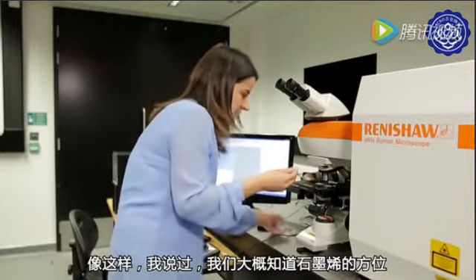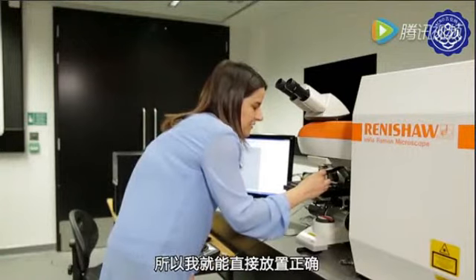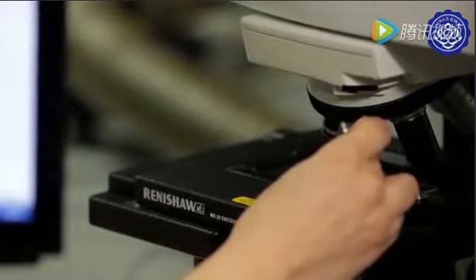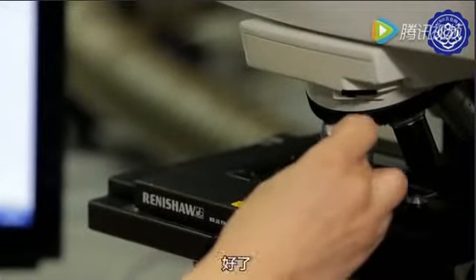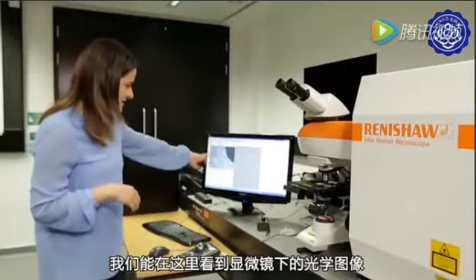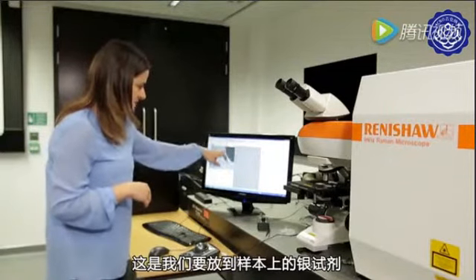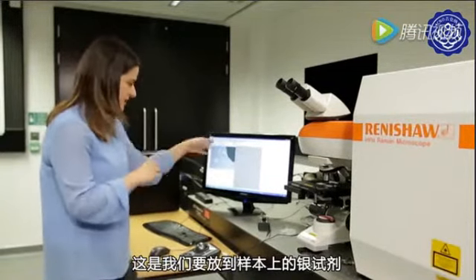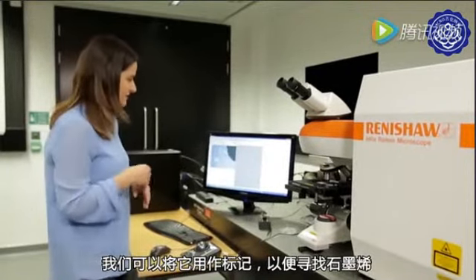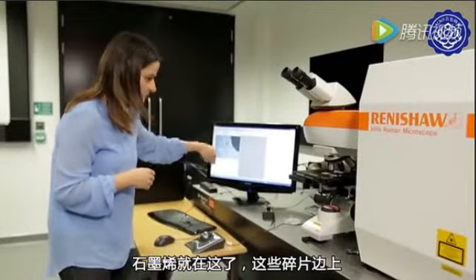Like that. As I said, we know more or less where the graphene is, so I can place it already in the right position. Yep. And here you can see the optical picture from the microscope, and this is a silver contact that we placed on the sample, because now we can use it as a marker to find graphene, and graphene is somewhere here next to this flake.